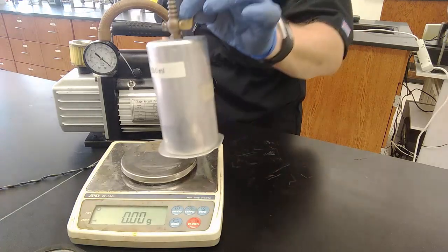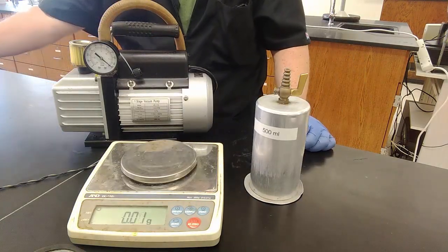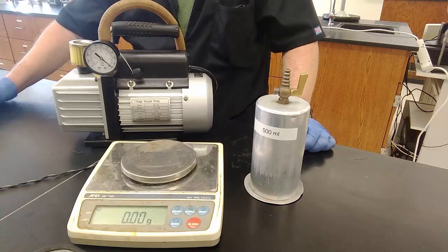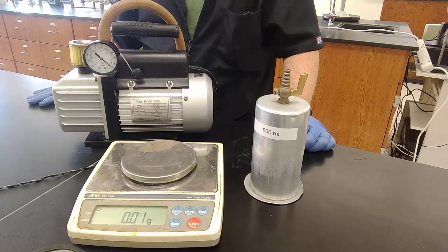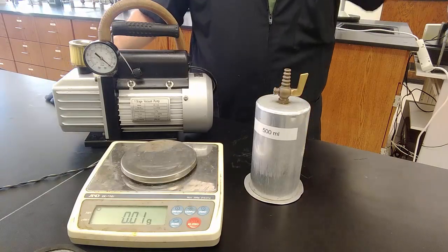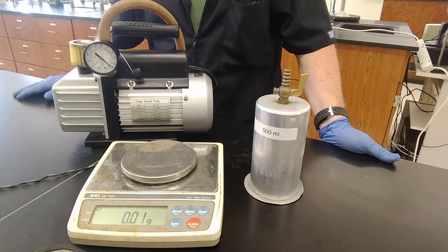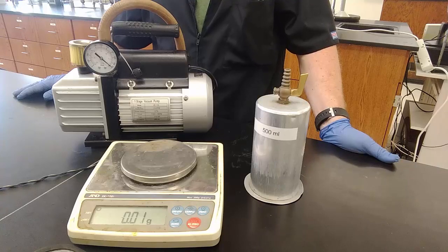And then we can compare our calculated value to the 1.185 from table 1.1. And this is a great step 3 here, or part 3, for figuring out why we have a density that is greater than or less than the expected value. There are reasons that you can think of.